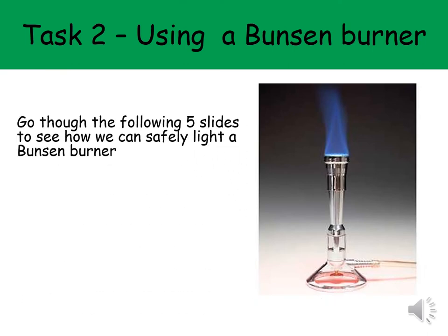We're now going to go through the next five slides on this PowerPoint to see how we can safely light up a Bunsen burner. So watch and listen carefully to each of the steps.